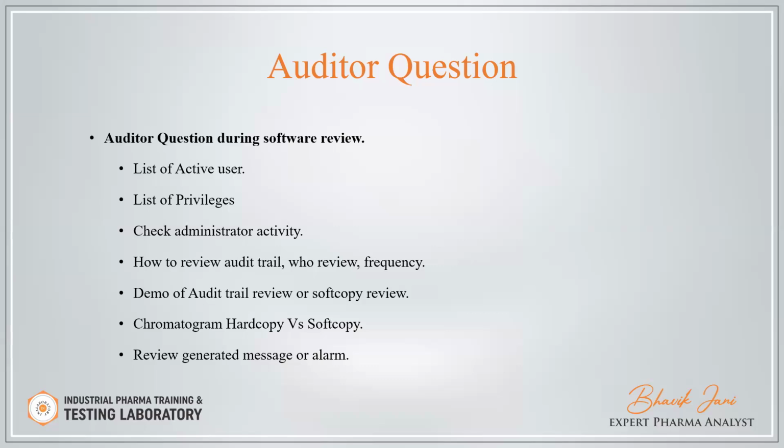Then review the generated messages or alarms. Whatever messages or alarms are generated, the auditor can review all these alarms or messages.